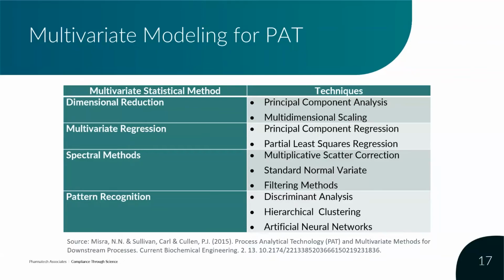And the problem that you run into is that data sets obtained from these spectroscopic tools are often very highly correlated or collinear with multiple other variables. So modeling a response with respect to a large number of, say, predictor variables can be difficult. And so data reduction and feature extraction methods become essential in order to shrink the data set down to something that's easier to understand.